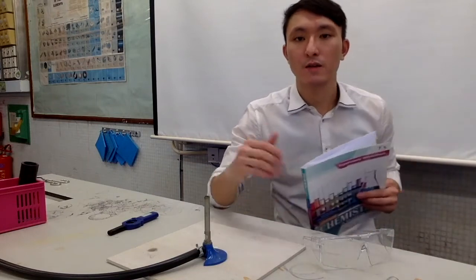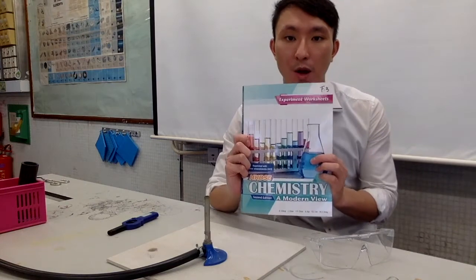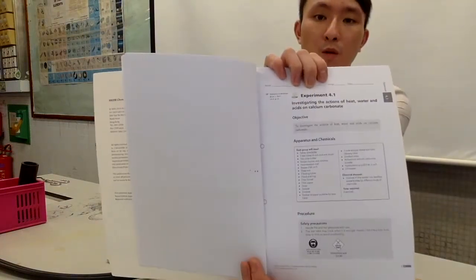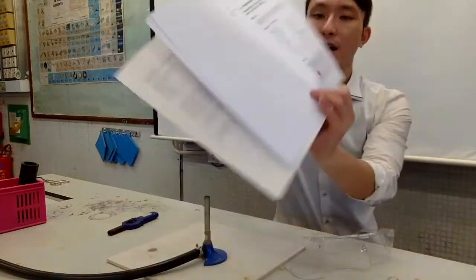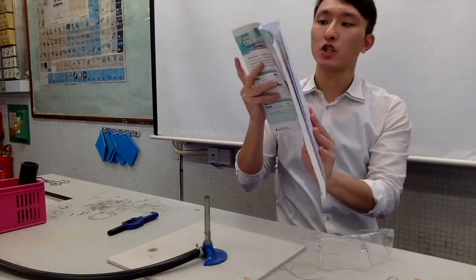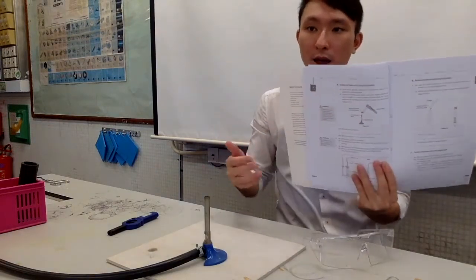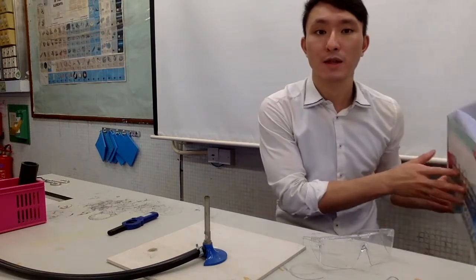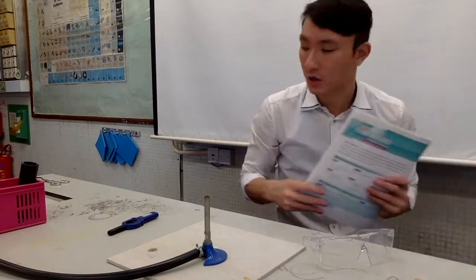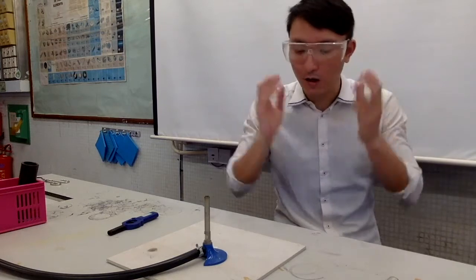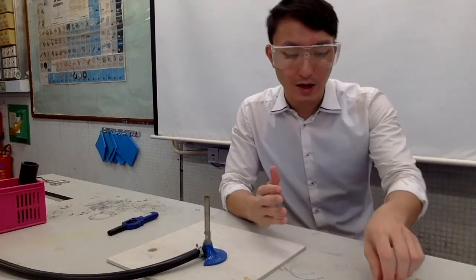I'm going to demonstrate a series of experiments from our lab workbook, experiment 4.1. According to the menu there are three parts: A, B, and C. I'll do them one by one and highlight some key concepts and things you need to pay attention to. First of all, safety goggles on. The first thing we're going to do is study the action of heat on calcium carbonate.